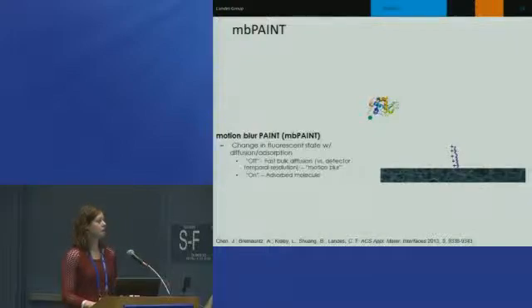So first of all, one of the nice things about ion exchange is that you can control the equilibrium and the binding characteristics by just controlling the salt concentration in the solution.